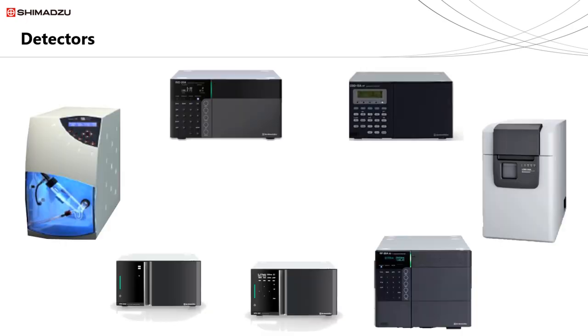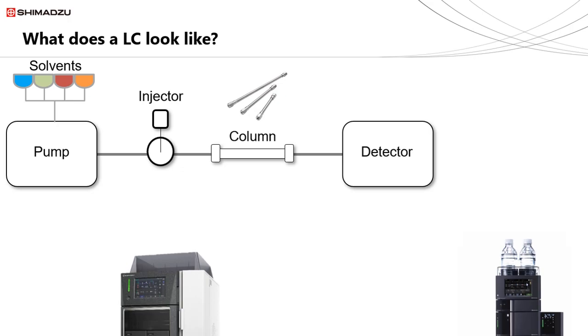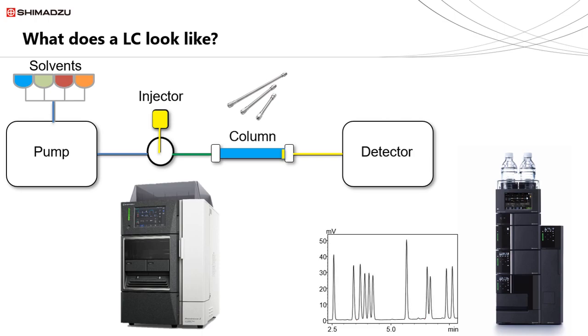As part of building a method, we must choose the correct detector to prepare our chromatograms. If the detector cannot see our compounds, we can increase our development time or even stall it completely. There are many types of detectors and our choice is crucial, and we will take the time in a separate webinar to go over the various types. When we have our final choice of detector, mobile phase, column and instrument, we will start to develop the best method. How do we make the best method? What do we do if the chromatogram changes over time? These sorts of issues will be covered in our further sessions in order to create the best method and optimise it. Lastly is an example of what we can do with our new knowledge.